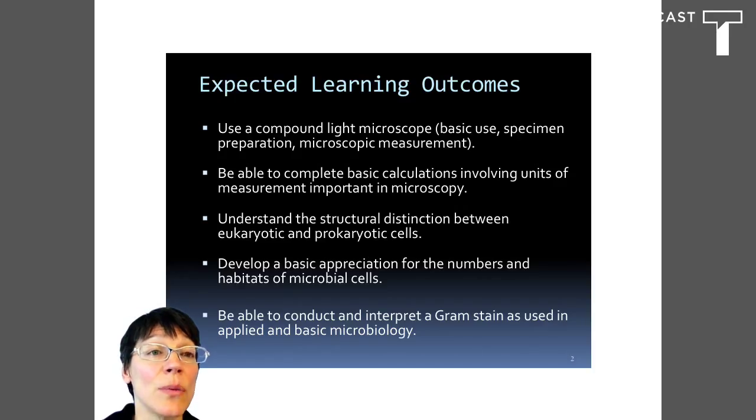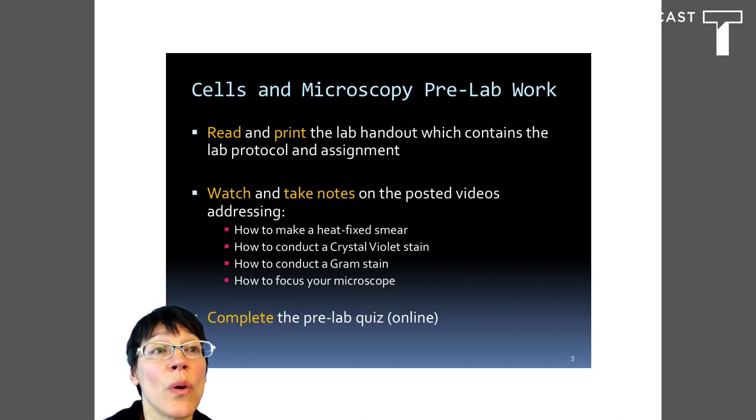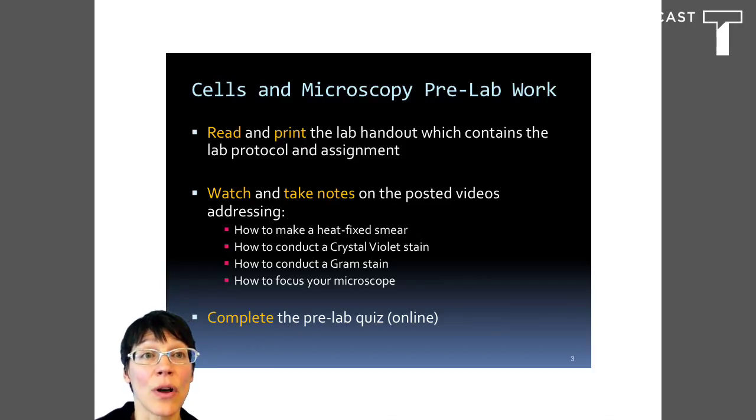We also want you to be able to conduct and interpret a gram stain as used in applied and basic microscopy or microbiology. So for the pre-lab work, you need to read and print the lab handout, which contains the lab protocol and the assignment.